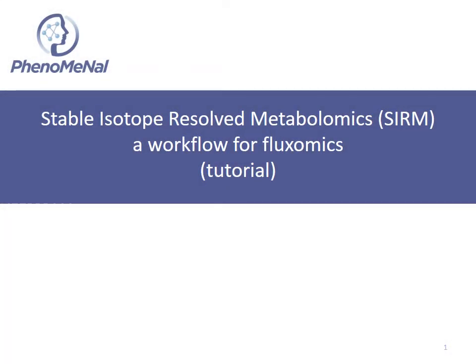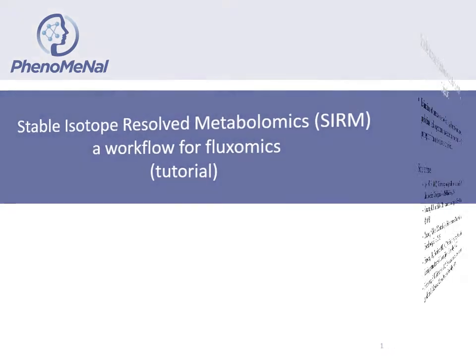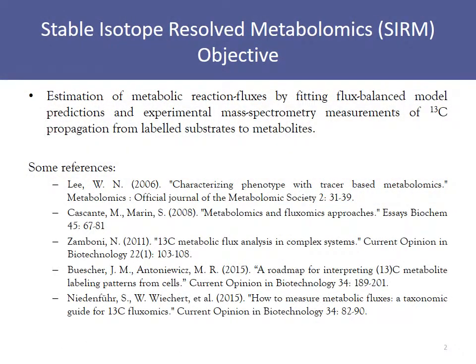A workflow for fluxomics. As an application of the so-called stable isotope-resolved metabolomics, the objective of our workflow is the estimation of reaction fluxes, by fitting model predictions and experimental mass spectrometry measurements of 13-carbon propagation.